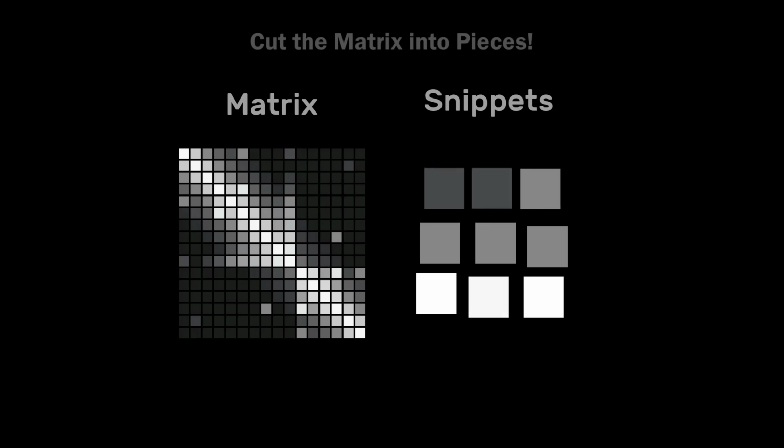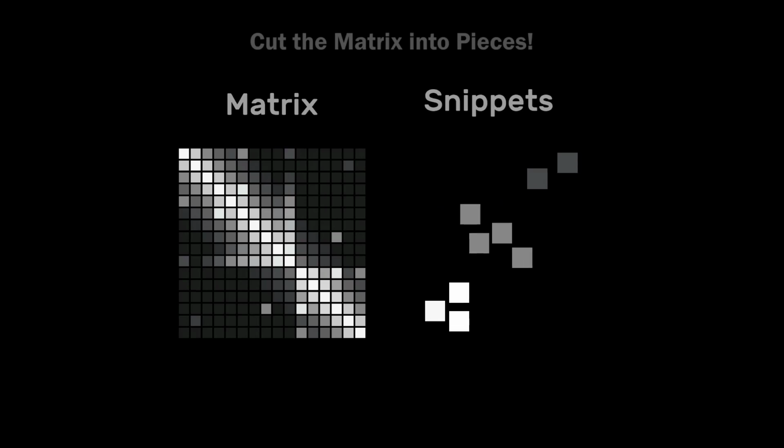Once you have that, you can rearrange them in whatever way. You can put them on a grid, or project them using t-SNE or PCA or something like that, and start exploring these snippets. You can also put them in piles on top of each other. As I said, there are generally many thousands of those, and you don't necessarily want to look at thousands of them. You might want to group them based on their similarities, and then we have piles.